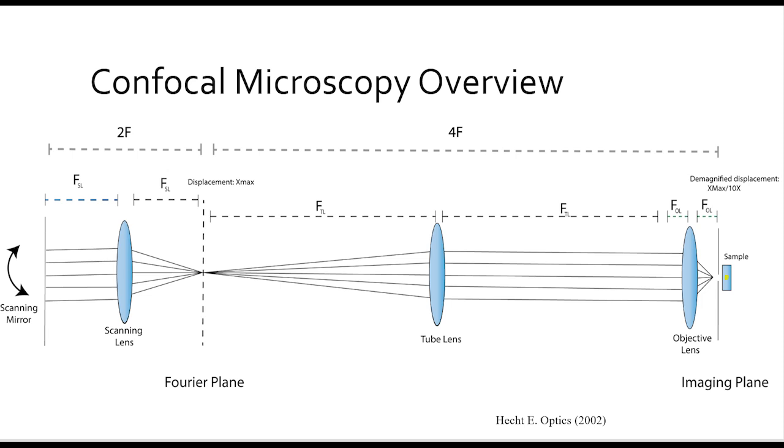Notice at the input at the scanning mirror, this light is collimated, that means it is going straight. So that is our first focus, is to collimate a laser through the system, and then we will manipulate these magnifications by adding lenses in our system.